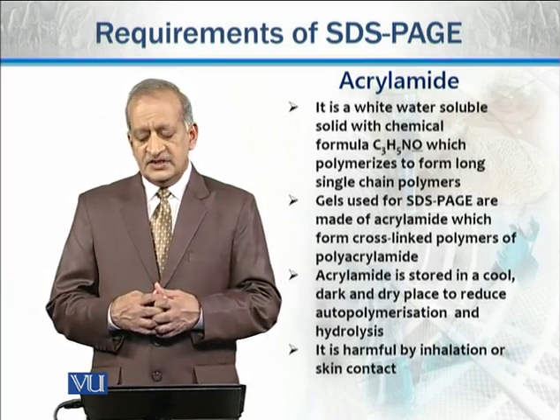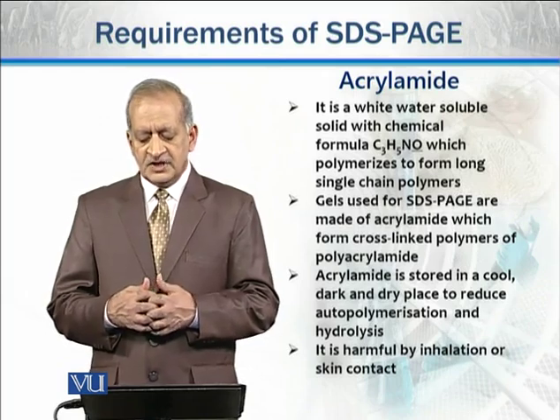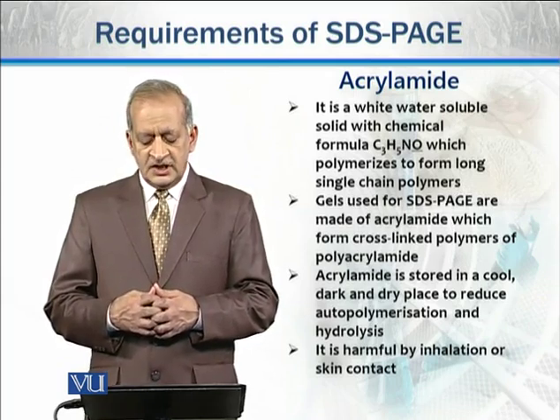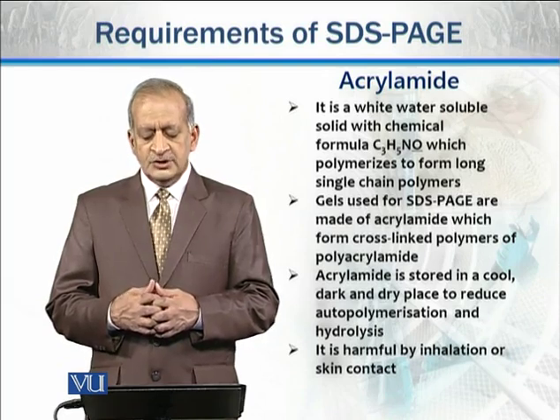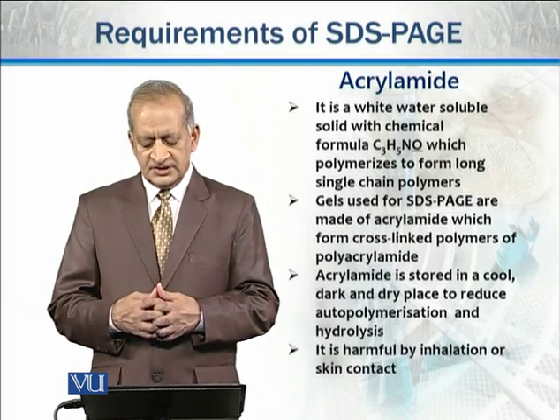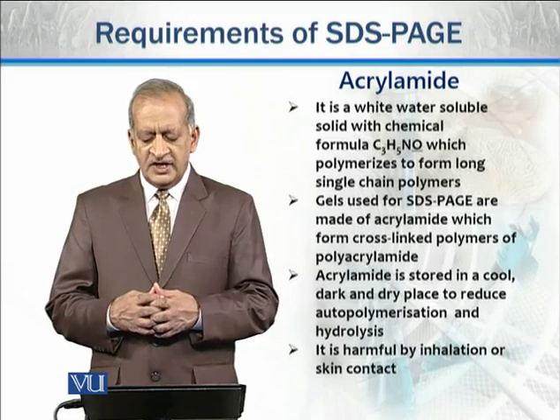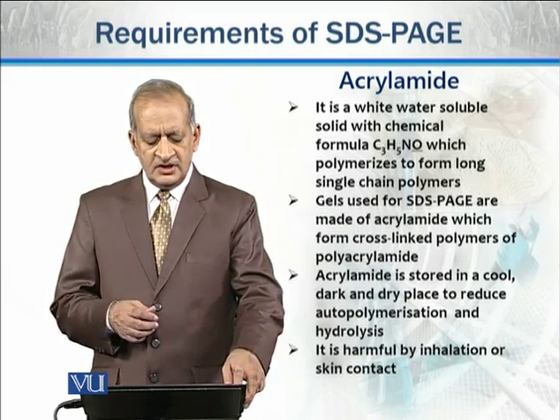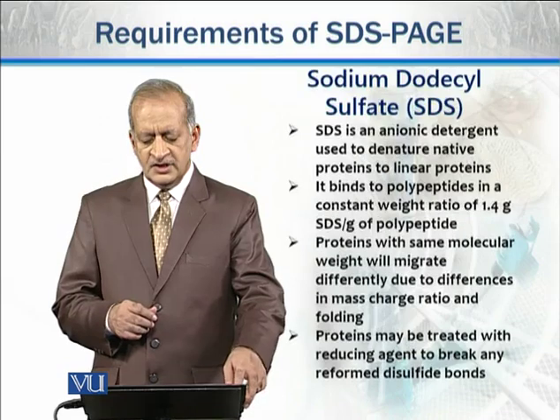Gels used for SDS page are made of acrylamide, which form cross-linked polymers of polyacrylamide. Acrylamide is stored in a cool, dark and dry place to reduce autopolymerisation and hydrolysis. This acrylamide is also harmful by inhalation or skin contact. That's why direct contact should be avoided.